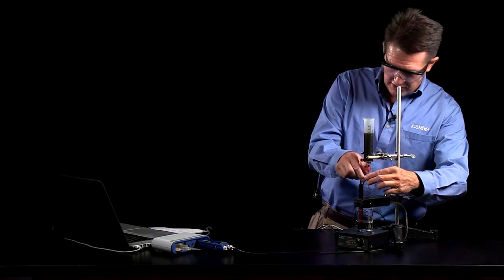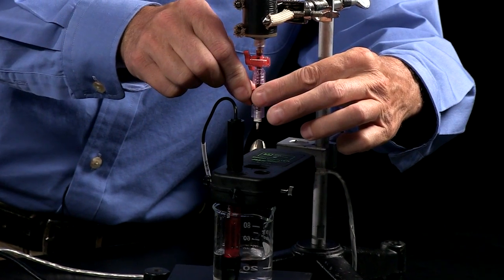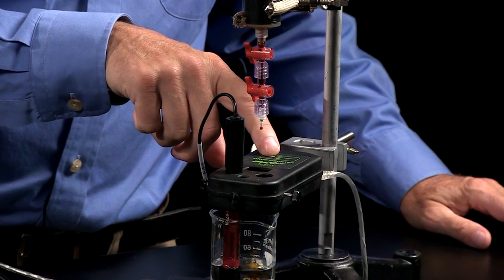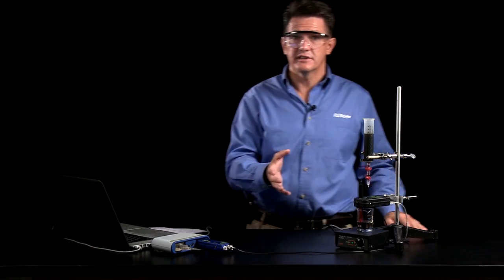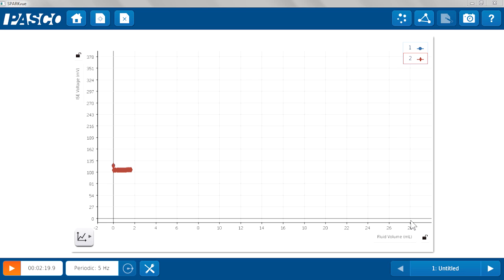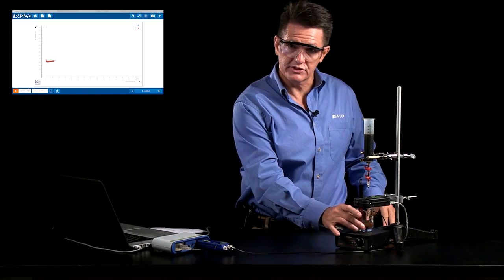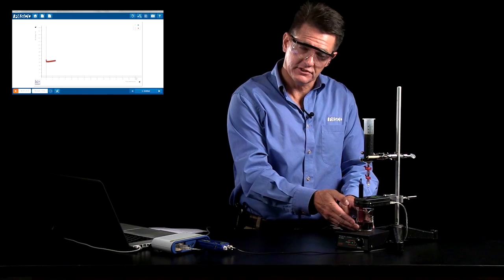I'm going to start my titration now. There I see the drops. I see the drop counter blinking on and off, which means that it is getting a reading. Once the students are done with this titration, they can determine the number of moles of vitamin C inside of this solution.